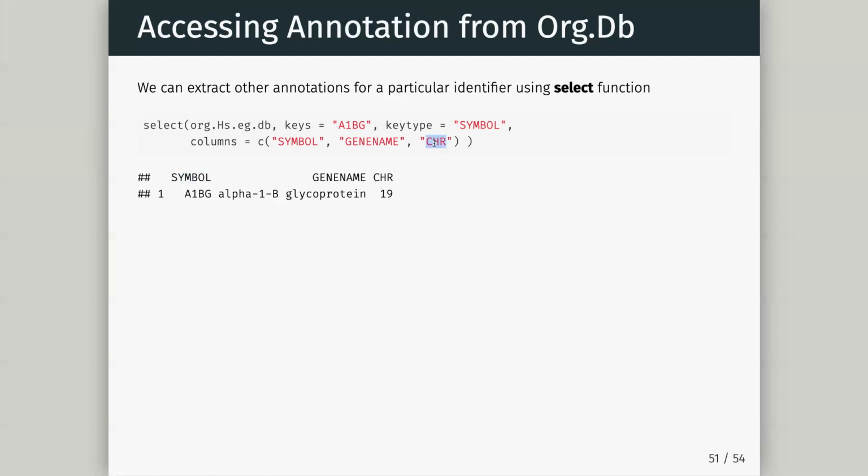I think this chromosome is actually being removed because they want it to be in the TxDb package, so it makes much more sense for it to be. So I think if you did this line, it actually gives you a warning: chromosome being removed to the TxDb package. But here we can turn a key, a symbol, what we may have on the end of our GRanges, the names, into a data frame containing, in the same order, additional information as specified by the columns.